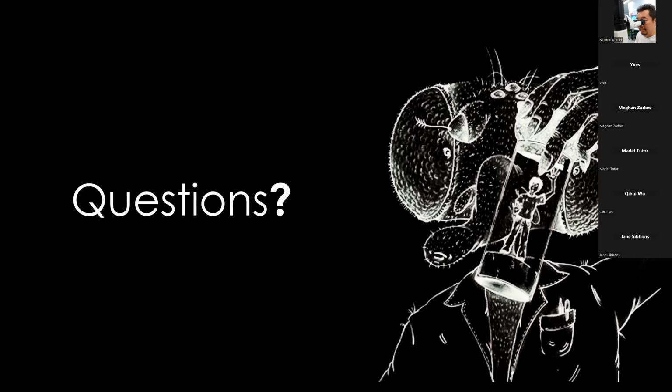So I would start with this one. Also, when people from other labs ask me to teach them expansion, I advise them to start with the first one, the pre-stained sample expansion.